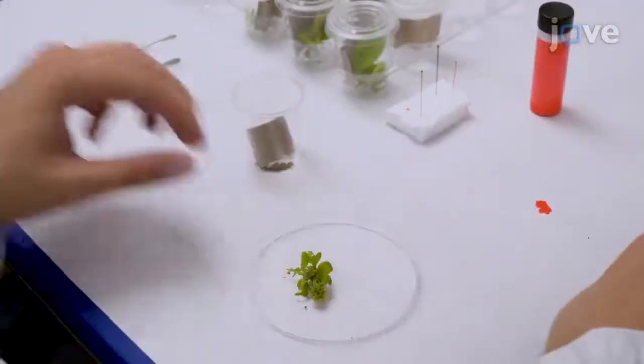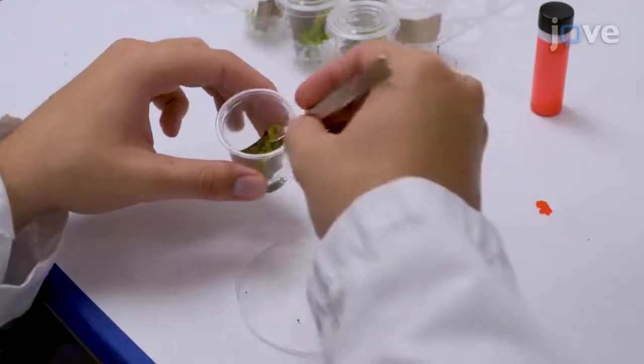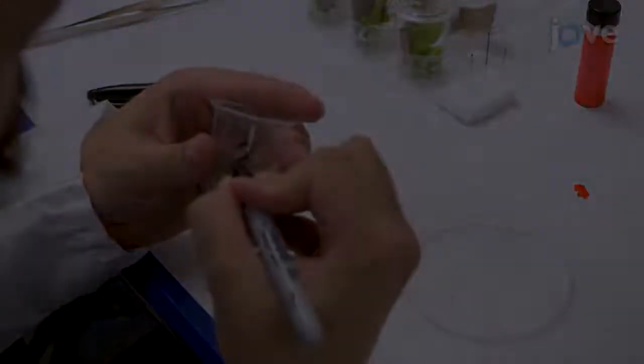With the help of a small camel hair watercolor paintbrush, place each individual larvae in its own 2-ounce clear plastic portion cup containing approximately 1-3 small leaves of fresh terminal host material.